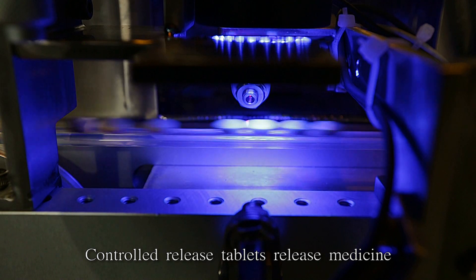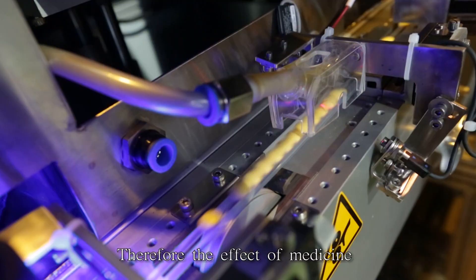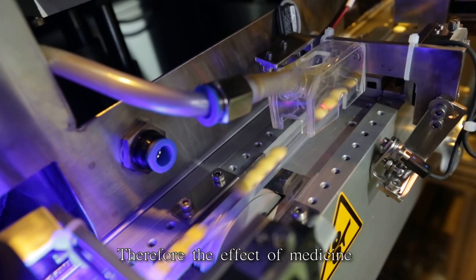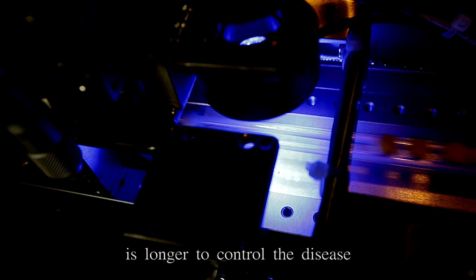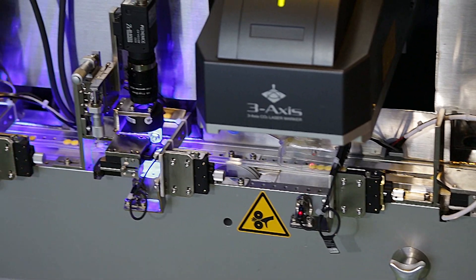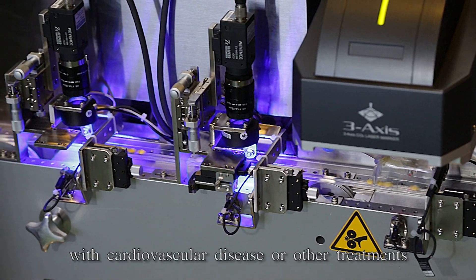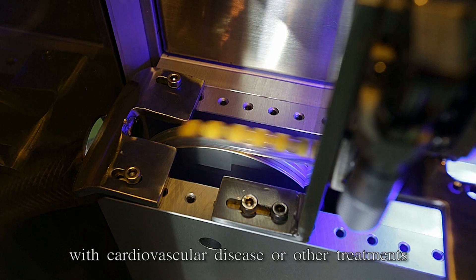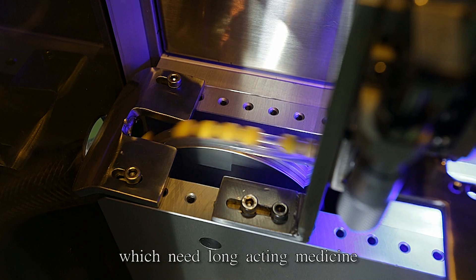Controlled release tablets release medicine over a long period of time. Therefore, the effect of medicine for the human body is longer to control the disease and reduces the frequency of using medicine. So far it has been applied widely with cardiovascular disease and other treatments which need long-acting medicine.